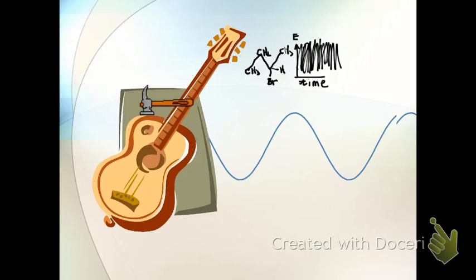In the NMR spectrum, you'd see a complicated waveform that begins to go like this, and you'll see repeating patterns in that waveform. We use a technique called Fourier transform, in which we take this time-based data, sorry, my bad, and we convert it into frequency-based data.